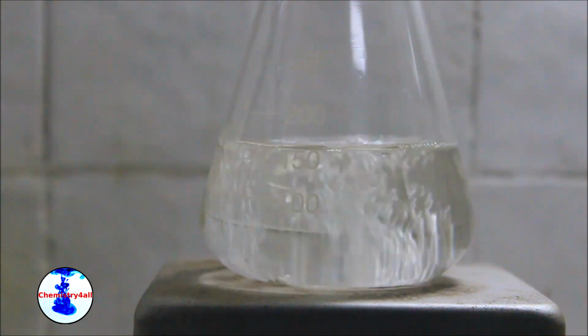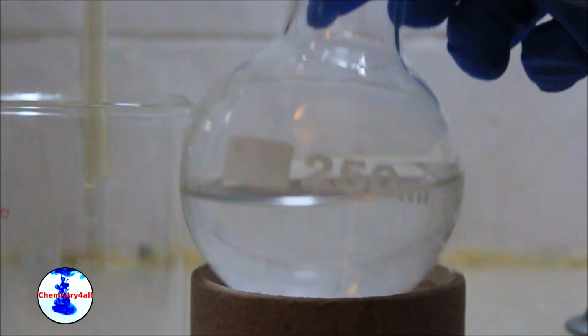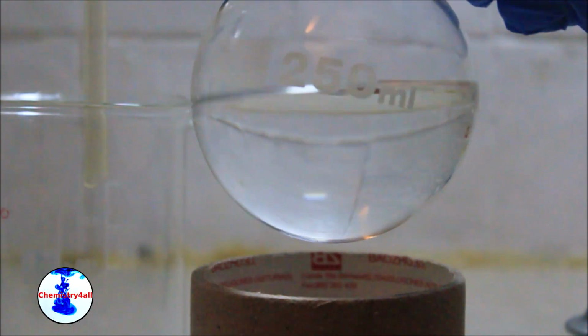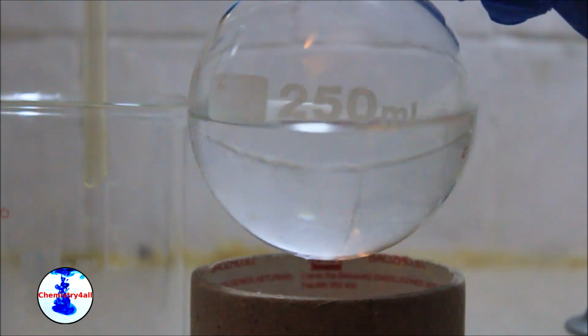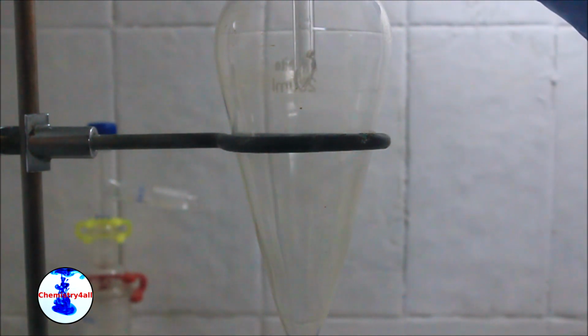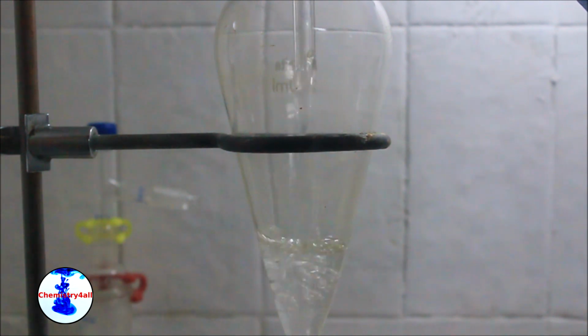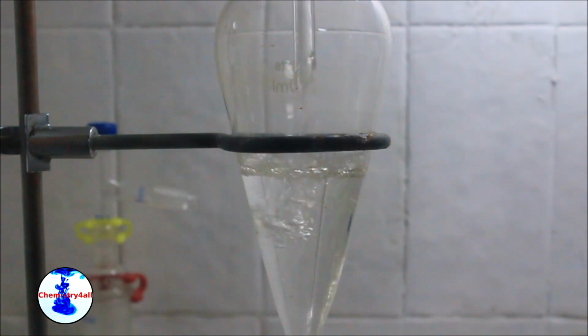The distillation should be continued until about 20 ml of solution are left in the flask. At this point, the distillate should contain ethyl acetate, ethanol, water, and traces of acid. Now we will further purify our product by means of liquid-liquid extraction. The distillate is placed in a clean and dry separatory funnel.